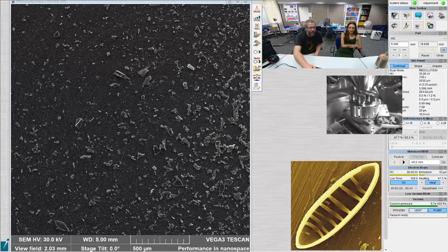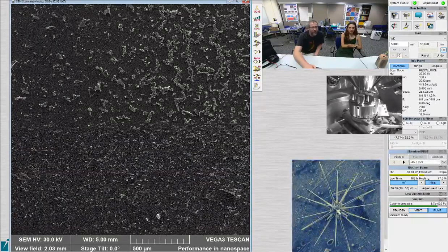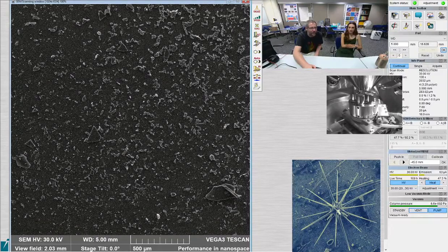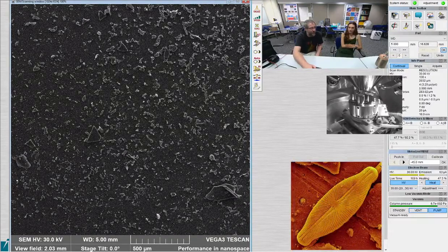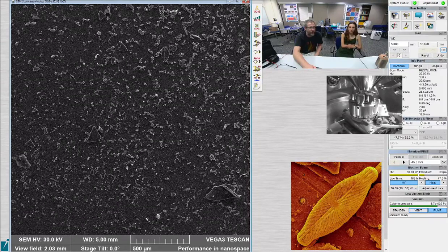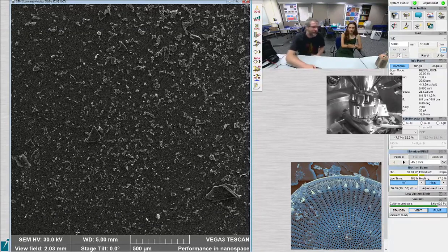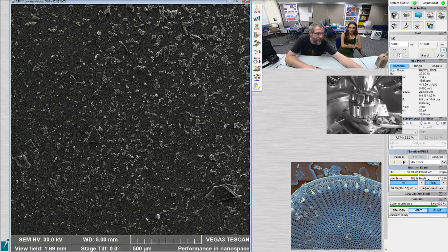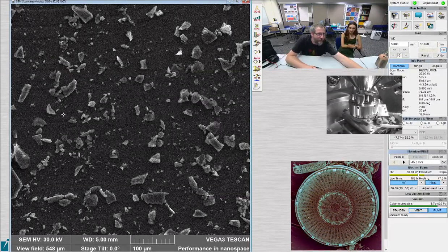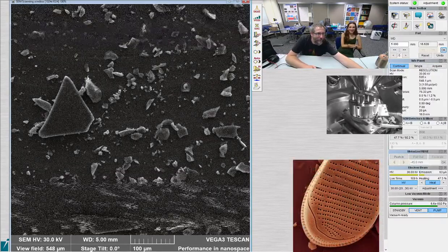So usually what I would do at this point is start looking around for diatoms that we can use. What are we looking for? So these samples are from the diatomite, from the Grove Lake site, the 6 million year old samples that Mark was talking about. They're captured in ash. These big triangle-shaped pieces up here are all ash, all the bigger pieces that don't look like a diatom. We're zoomed really far out, so we're not going to see diatoms at that scale very easily. Hopefully we will when we zoom in. Otherwise, it's going to be a long day looking for them. We might need to prep some more material.